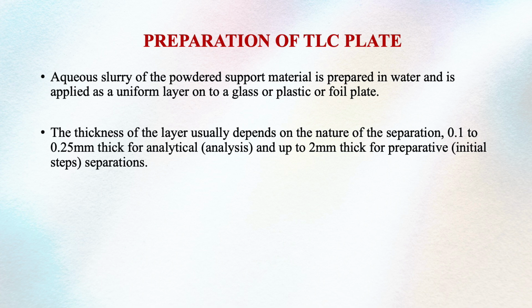However, in the market nowadays ready-made plates are also available. If you are interested, you can prepare and use them. The important point to remember here is that the thickness of this layer depends on the type of technique that you are going to perform. For example, for an analytical technique, the thickness of the layer will range from 0.1 to 0.25 mm. Whereas if you are going to perform preparative TLC, then you will take only 2 mm thickness of the TLC.